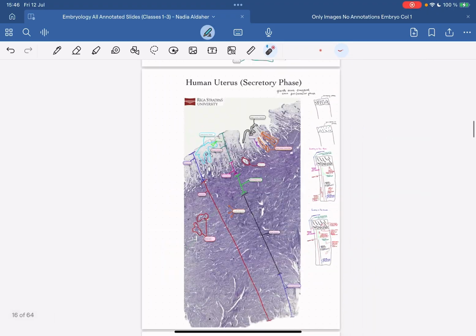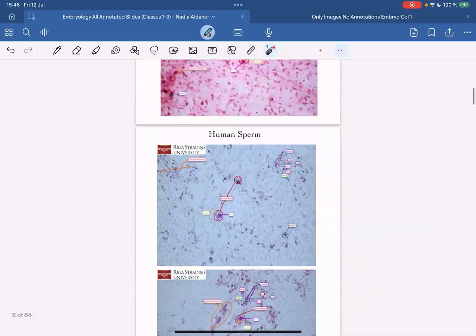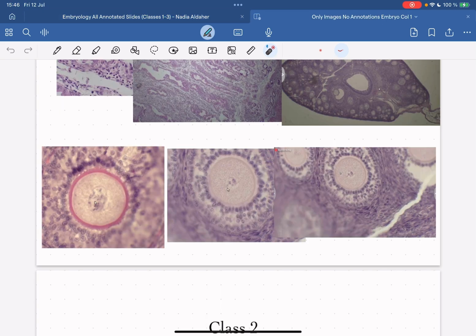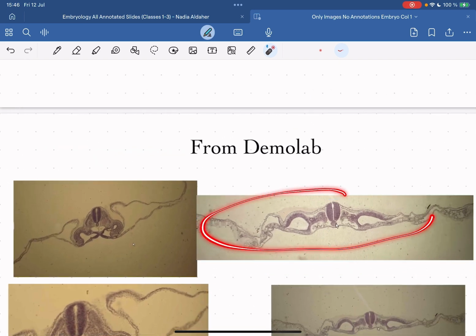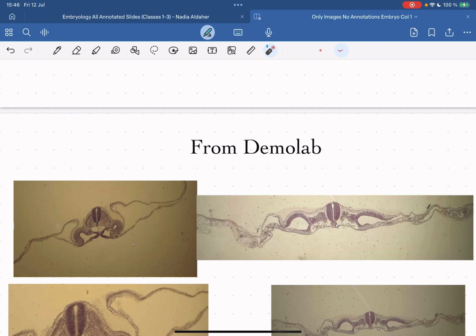Okay, that was the egg follicle real fast. Now we're going to get into a little bit more of a unique structure, namely the germ layer. Now, we have two slides in this colloquium that look very much alike. I'll show it to you in a second. So these two would be a good example. This slide and this slide are the same, but they're at different developing times, right? So this and this would actually be two different slides for your colloquium.